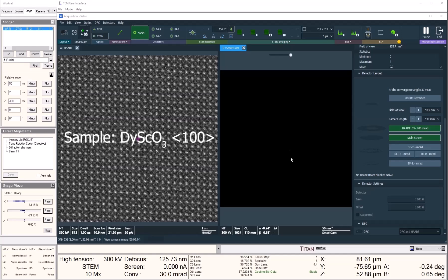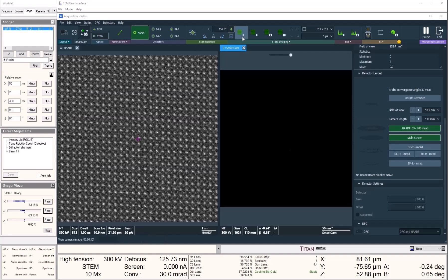To do this, we would like to first establish high-resolution STEM condition. What we'll see here is a FIB prepared lamella sample of Dysprosium scandate on its 100 zone axis. I have tuned the electron beam condition so that we are now ready to take atomic resolution images.